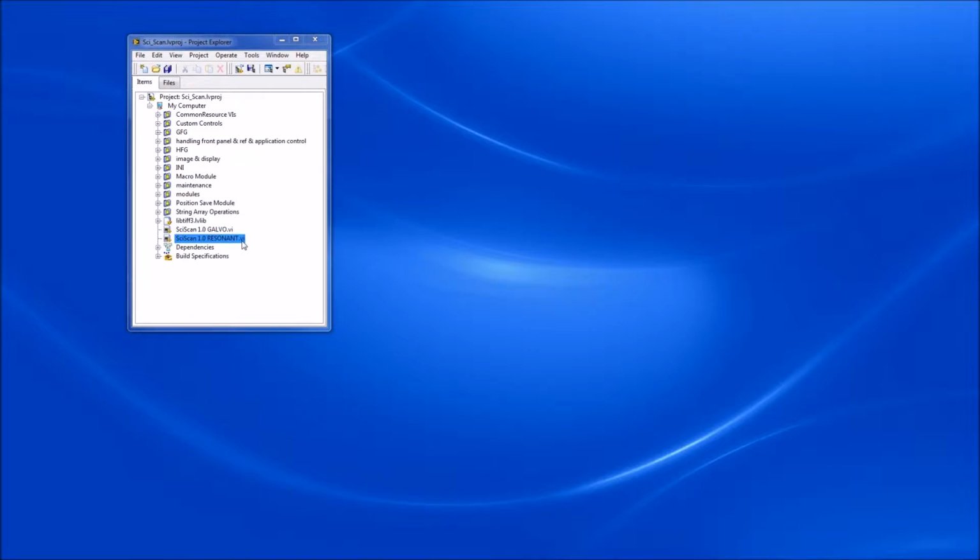This video assumes that you have already installed all the prerequisites for SciScan and configured the system to work with your hardware. If you haven't installed the prerequisites yet, please go to our knowledge base online at sciscan.scientifica.uk.com and follow the instructions there. Alternatively, get in touch with your Scientifica representative and they will be able to assist you with installing all that.